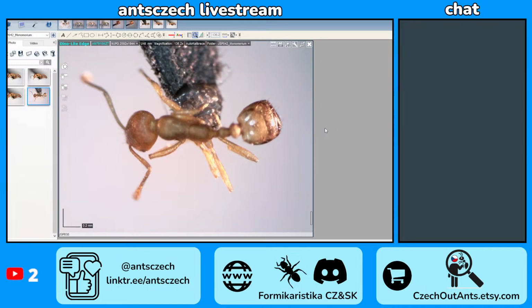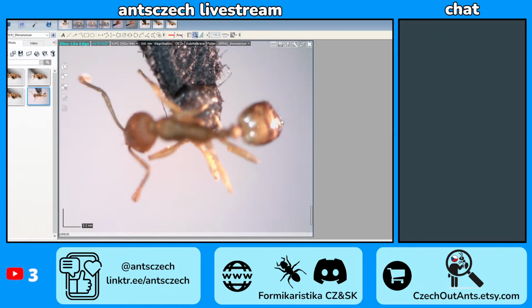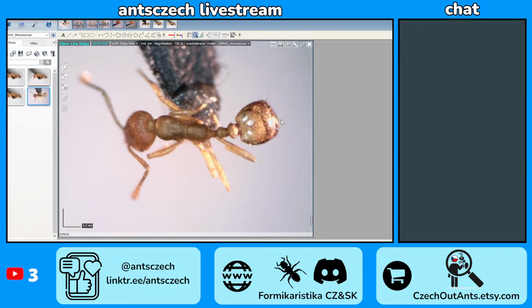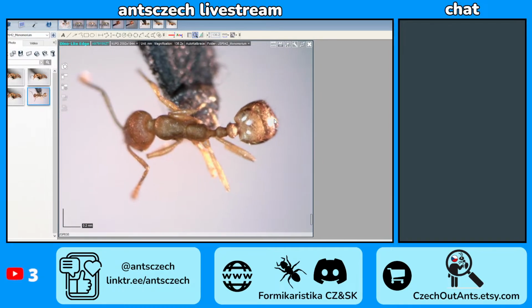Wow. And it only has one, two, three, four, five, six, seven, eight species out of basically 80. Very helpful. Well, I can check out the workers which are even shown.